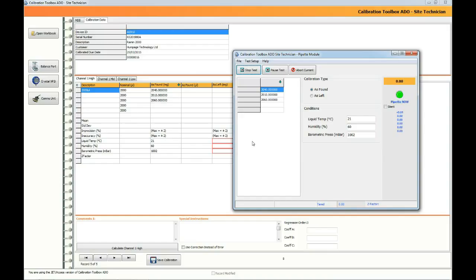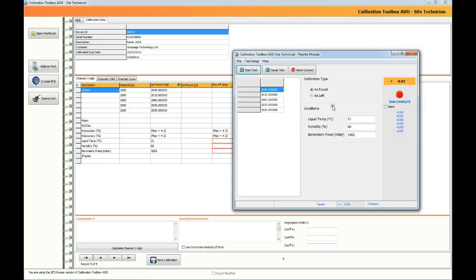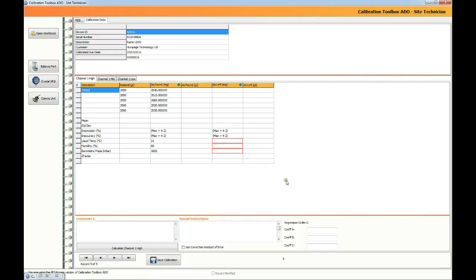So while we're doing this, the reason why people calibrate pipettes is twofold. One is it's just a routine check to make sure that the pipette is working correctly and is fit for use. The second sort is carried out less frequently, and that is where you actually calibrate the pipette and adjust it or repair it if need be, and then perform an as left calibration.